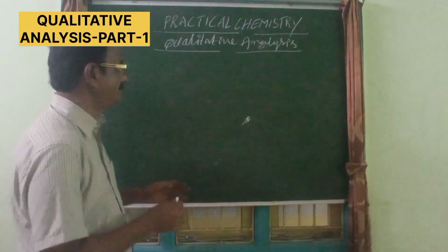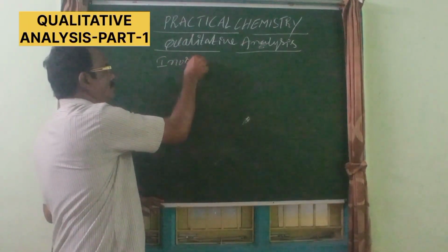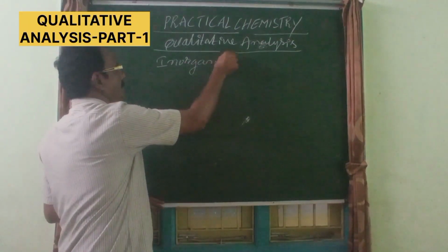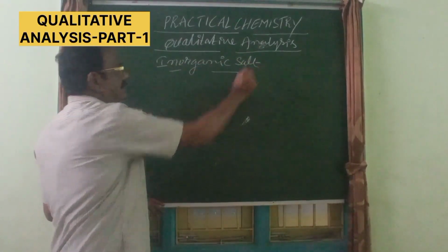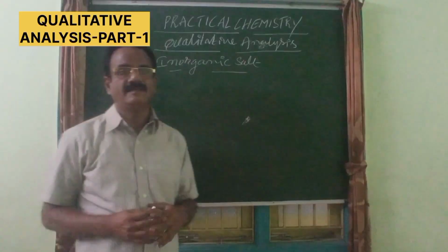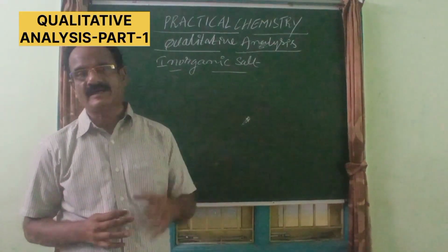Each and every inorganic salt contains one anion and one cation.